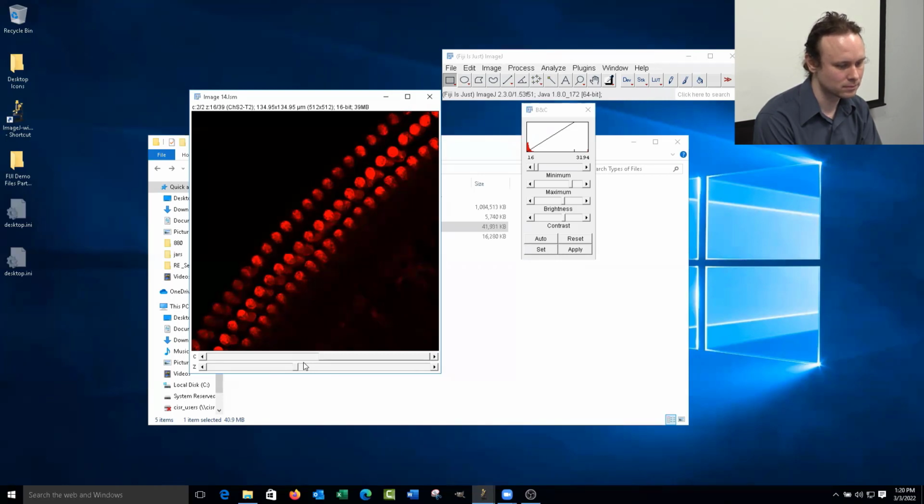Yeah, so it's not too much of a question. It was just more to expand on the question that Laura asked, and I think that you touched on it. I know you said to open all of them, and one of the things that I do specifically for my images is I will open up all of them, and I will specifically look at my positive and negative control. And I actually modulate my max and min according to my positive control and then hit propagate to all open images. So that way I'm going on ahead and doing that. Is that appropriate, or do you have a better way to do that? That's a good way. Using a positive and negative control are really the best ways of setting these.